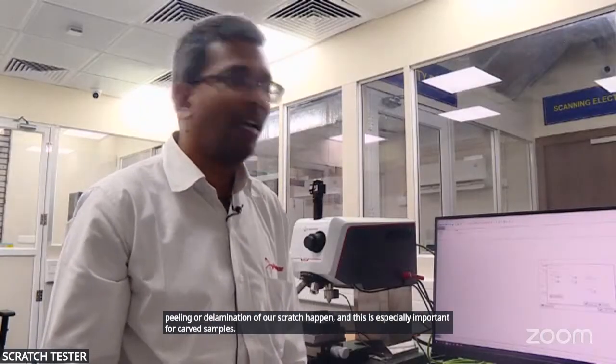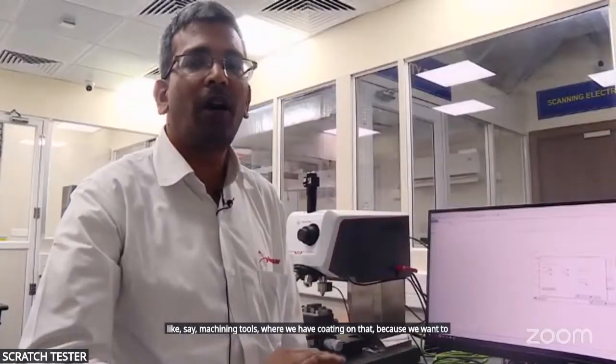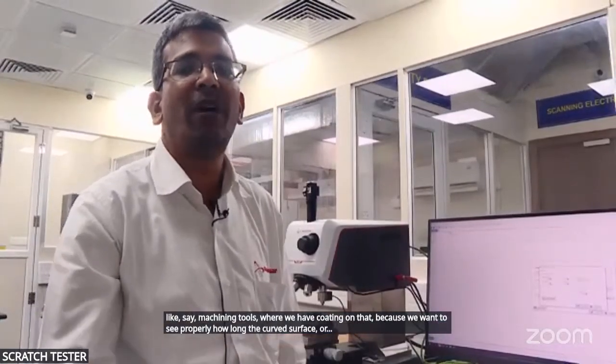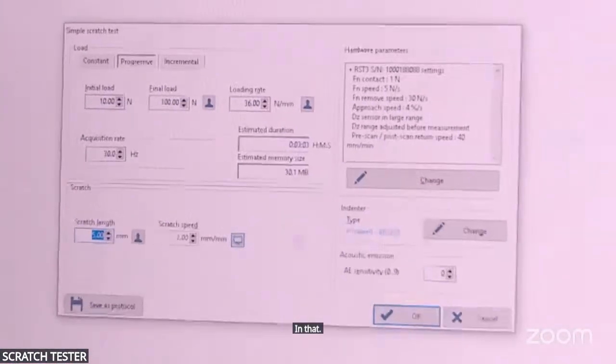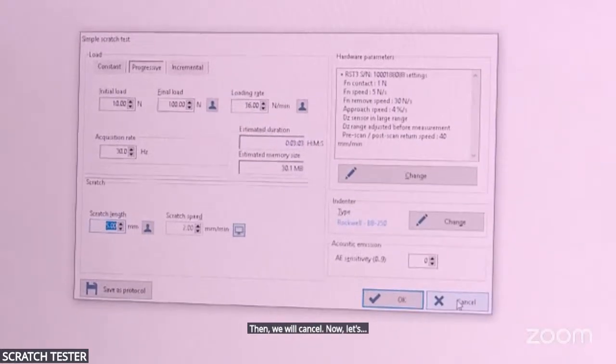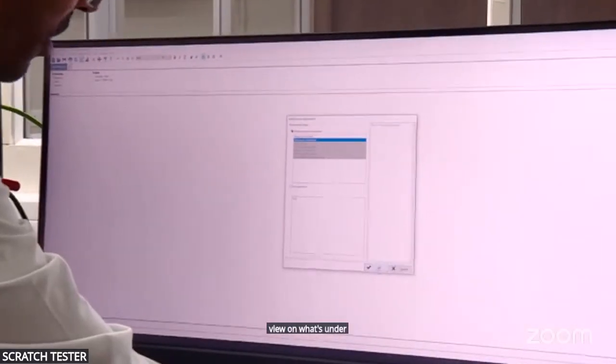This is especially important for curved samples, like machining tools where we have a coating, because we want to see properly how good my coating is along the curved surface. Then we will cancel. Now let's go back and have a look at what's under the advanced options we also get.